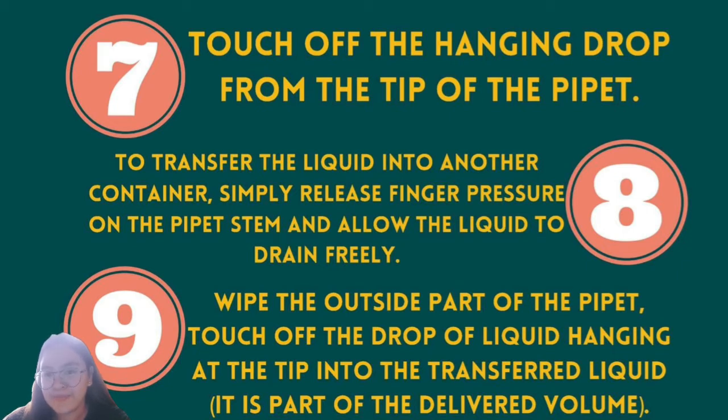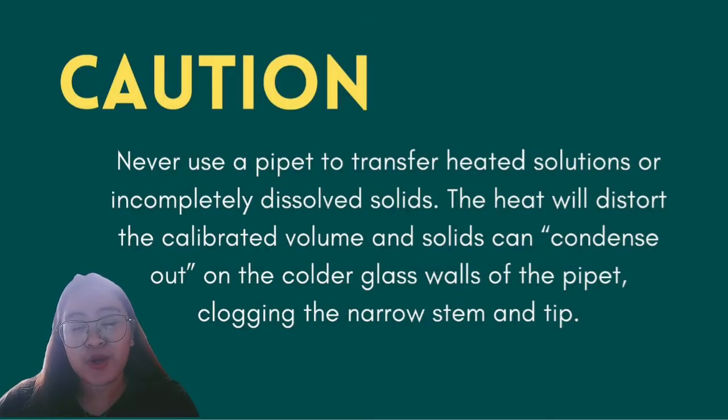to drain freely. Ninth, wipe the outside part of the pipette. Touch off the drop of liquid hanging at the tip into the transferred liquid. It is a part of the delivered volume. So, we must always remember that we should never use a pipette to transfer heated solutions or incompletely dissolved solids.